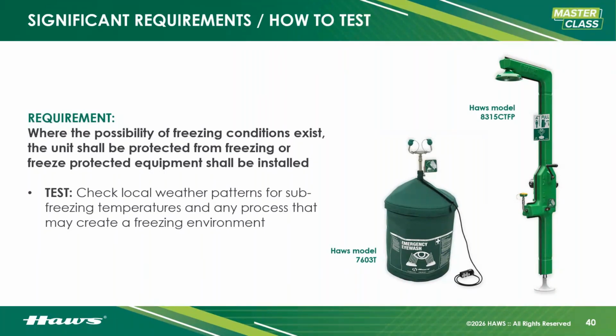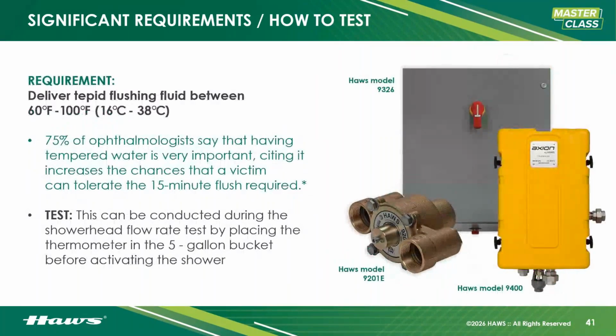So check your local weather patterns, plan appropriately. It also has to deliver tepid flushing fluid: 60 degrees Fahrenheit to 100 degrees Fahrenheit, or 16 degrees Celsius to 38 degrees Celsius. Within those ranges, it's not a hot, warm shower, but it's warm enough that it is going to be comfortable for the victim to stay in.